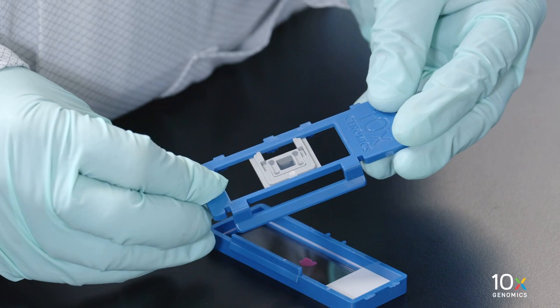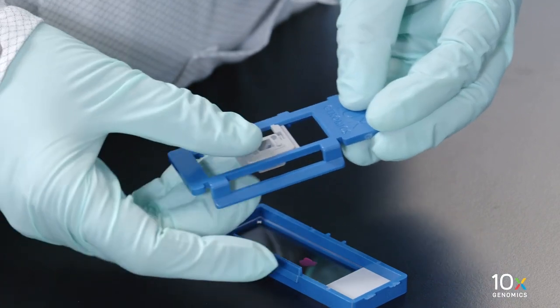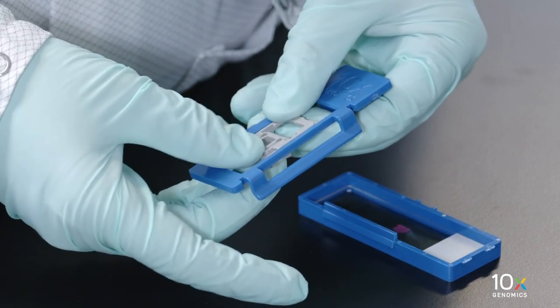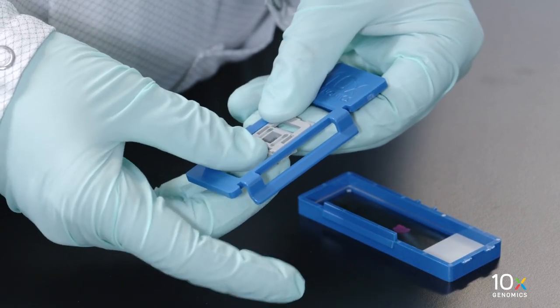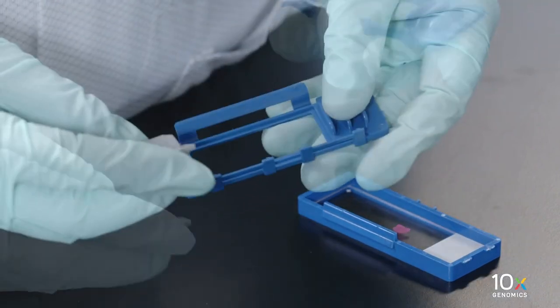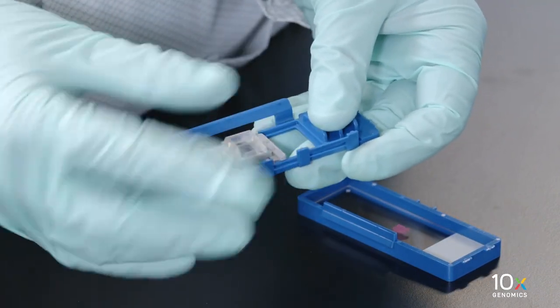To confirm that you have assembled the gasket correctly, check that you can adjust the gasket horizontally. If the gasket only adjusts vertically, then this indicates incorrect gasket assembly. Rotate the gasket to enable horizontal adjustment.